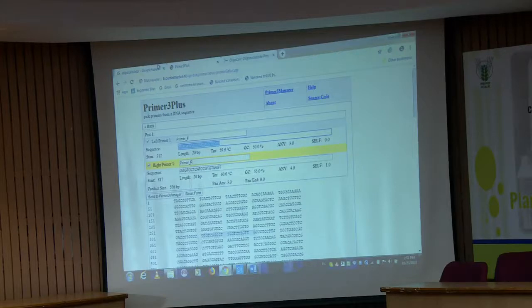So, if you want a specific primer, then please do the NCBI blast also. That will highlight it, because suppose you have a sample that is unknown to you, you do not know what it is, right. So, it may be anything. From there you can have an idea that it can bind in other genomes, other organisms also.